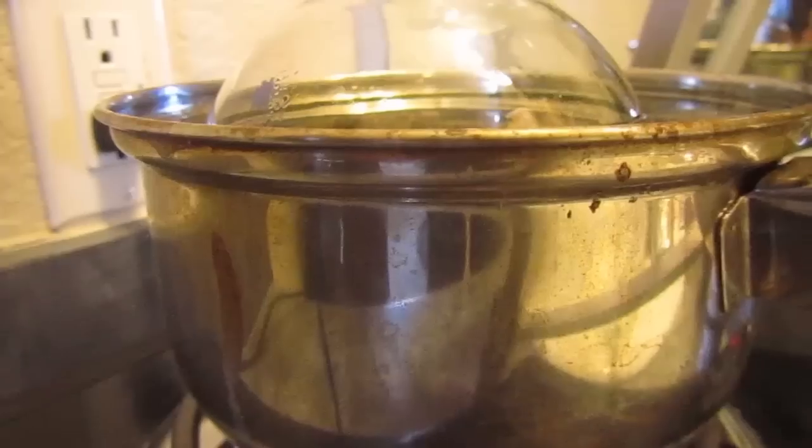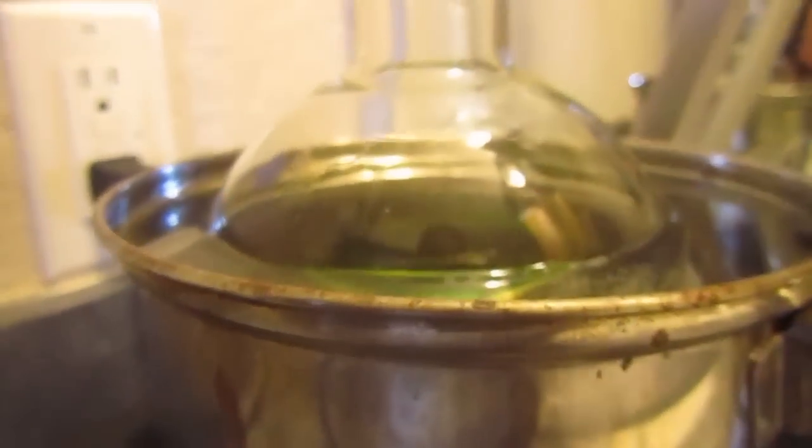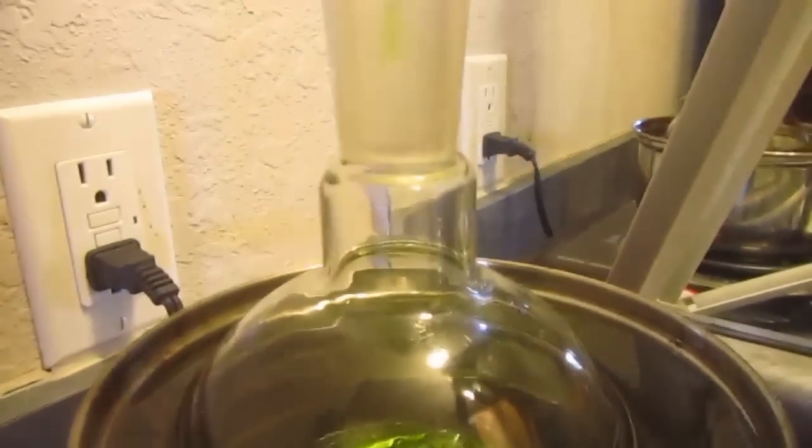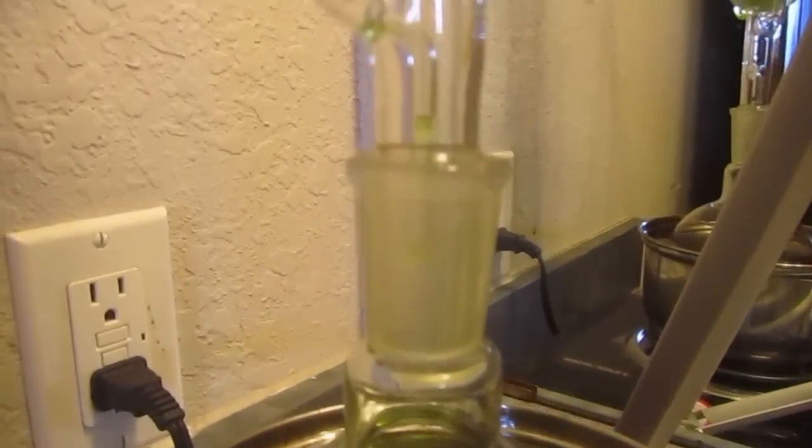Hello guys, and welcome to another episode of Backyard Scientist. Today I got some new equipment. Alright, here we go. Can you tell what it is yet? You know already what it is. It's a Soxhlet extractor.